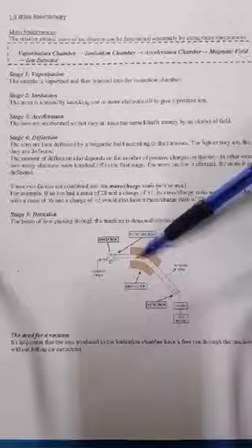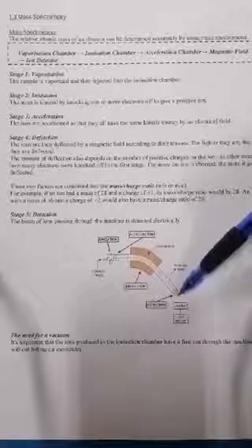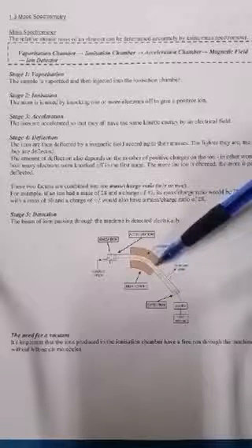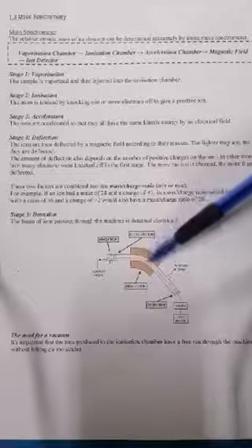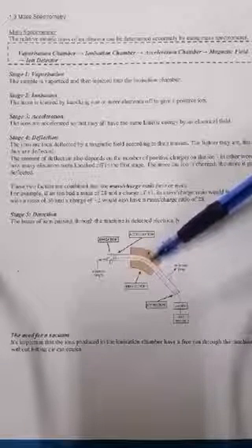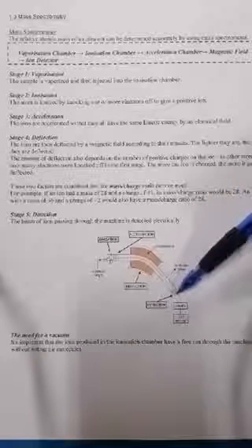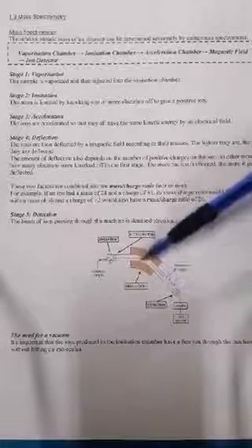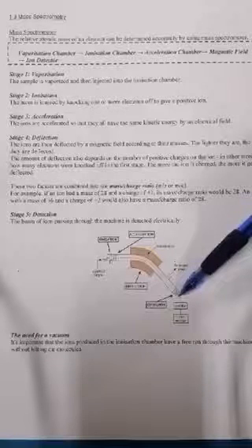It needs to be adjusted so that it falls directly onto the ion detector, not knocking into the wall. Once it knocks into the wall, it will combine with the leftover electrons inside and turn back to the atom with neutral charge. So it cannot be detected by our ion detector. So we need to adjust the magnetic field so that it only falls onto the ion detector.